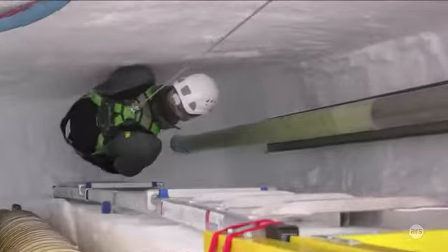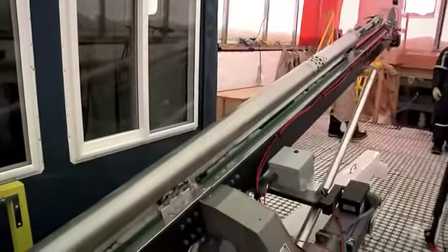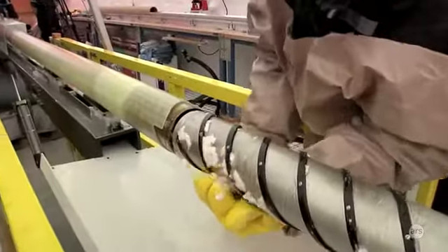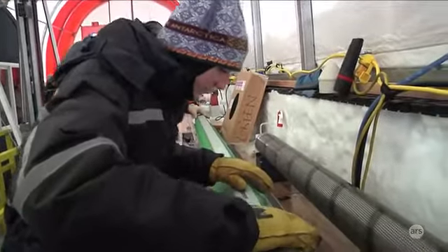So the South Pole Ice Core has a couple of main goals. One of those goals is to get ultra trace gases. The reason this is a good site for it is that it has a unique combination of being very cold because it's so far at the pole, yet has a relatively high snowfall.